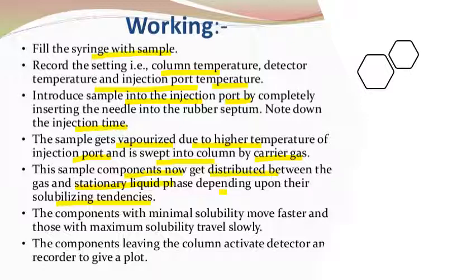So here, if we are talking about the liquid phase, the components with the minimum solubility, that is less solubility, move faster, and those with the maximum solubility, that is highly soluble, travel slowly. The components leaving the column are detected by the detector, and that goes on recording to the recording unit.